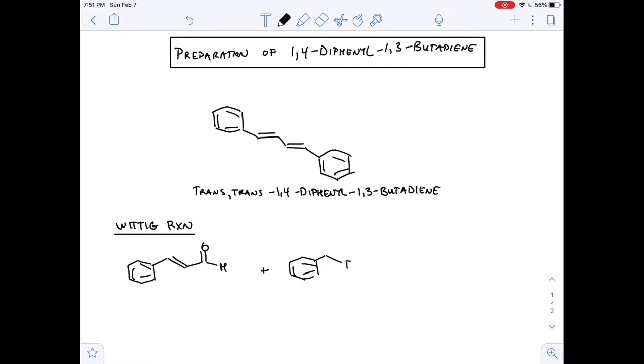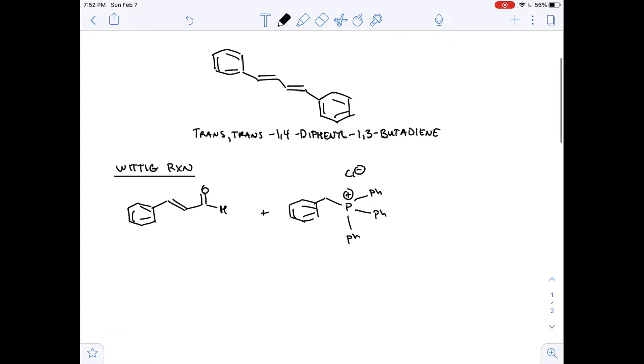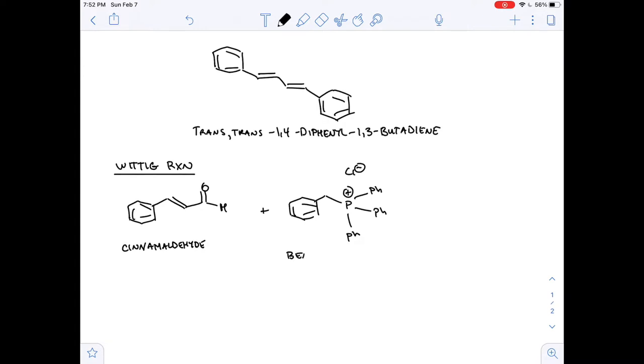benzyl phosphonium chloride, okay? So it's basically got a phosphorus atom bound to that benzyl position and three phenyl groups, right? So remember that Ph is short for phenyl, which is that benzene ring, okay? And it's got a positive charge because it's got four bonds to it, and it's in the same group as nitrogen, so it's only supposed to have three and a lone pair. But it's also phosphorus, so it can have that expanded octet. And then its counter anion is chloride. That's why it's called benzyl triphenyl phosphonium chloride, right?